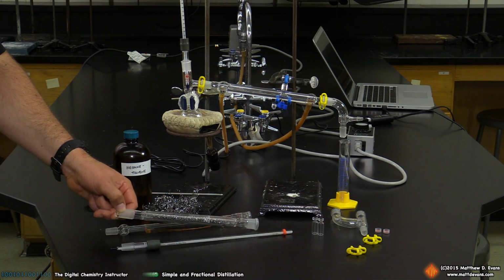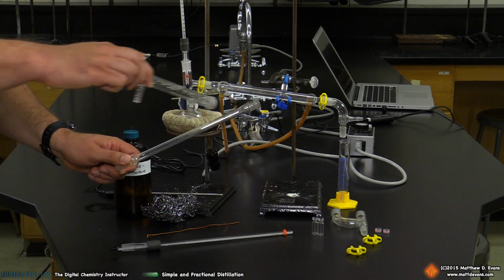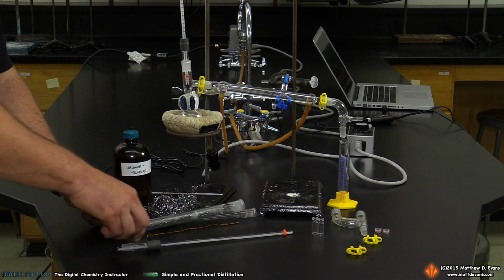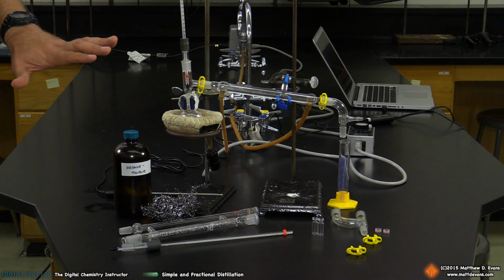For fractional, again, you're going to pack a column, one of these fractionating columns, properly. Don't pack in the material too tightly into this. Don't forget to position your thermometer really correctly.